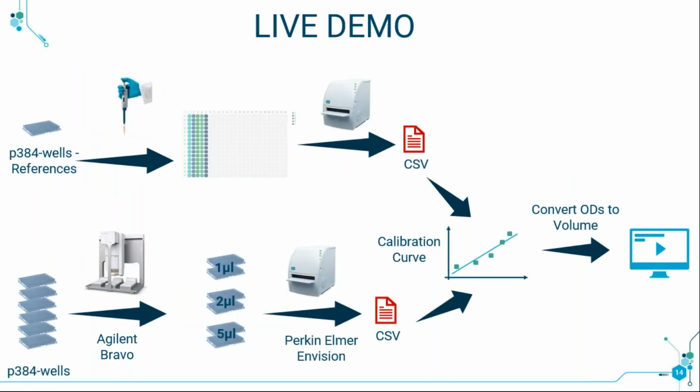To be a little more schematic and add some information, this is how the use case will happen. We will start by using a reference plate, because in my case, I fill the plate with a calibrated mechanical pipette. I filled 5 columns of my plate with 5 different volumes: 1, 2, 4, 5, and 7 microliters.